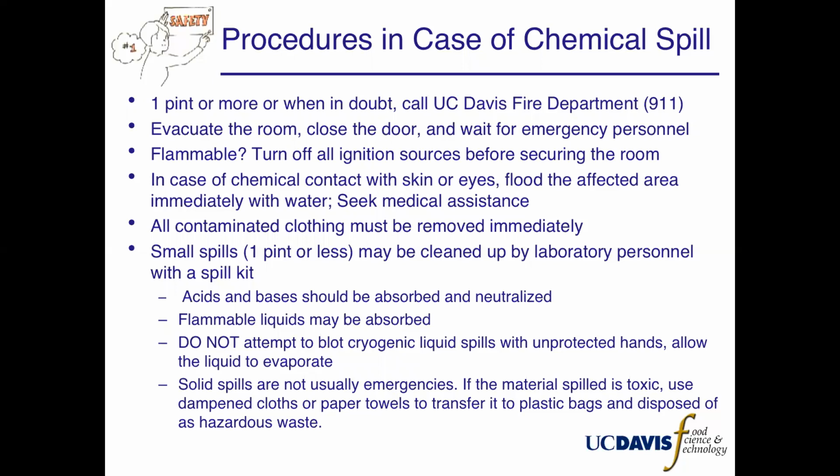In case of chemical contact with skin or eyes, flood the affected area immediately with water and seek medical assistance. Remove all contaminated clothing. Do not be concerned with modesty in the event of a chemical spill. Some labs may even keep spare lab clothing for this purpose.